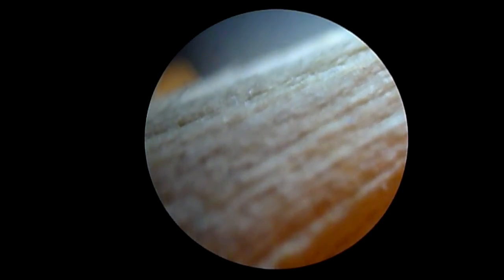Let's see what focus we get on there. The wood. That gives you an idea of just the clarity at this high magnification, but it's still fairly low for this scope. This scope can go to 400 times. You can see it's still quite shallow, so you have to move it along to see the focus of the whole object.